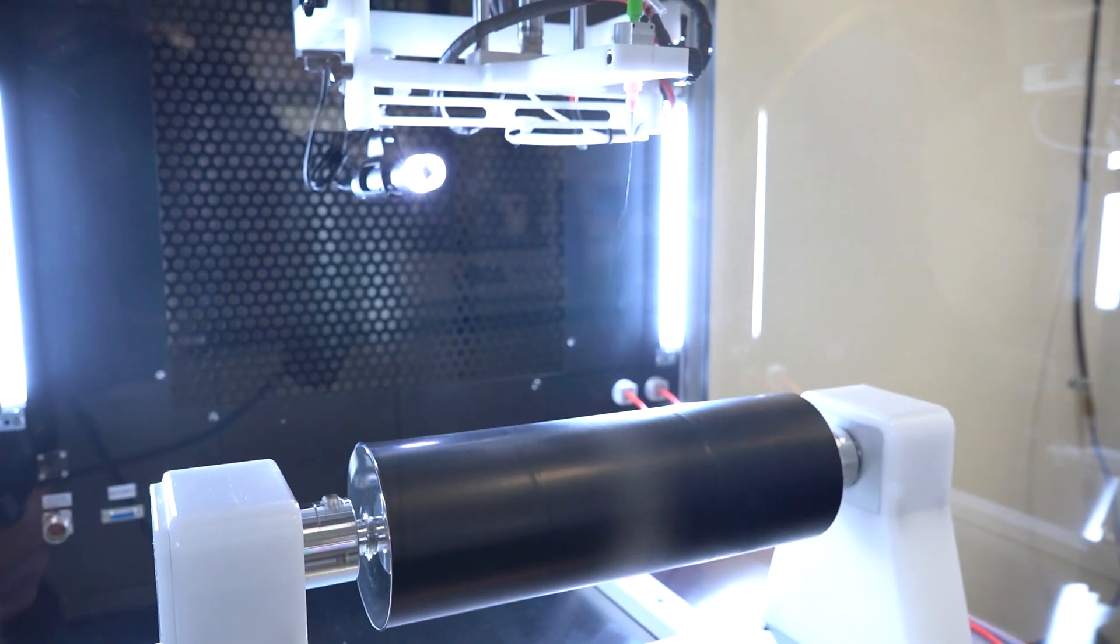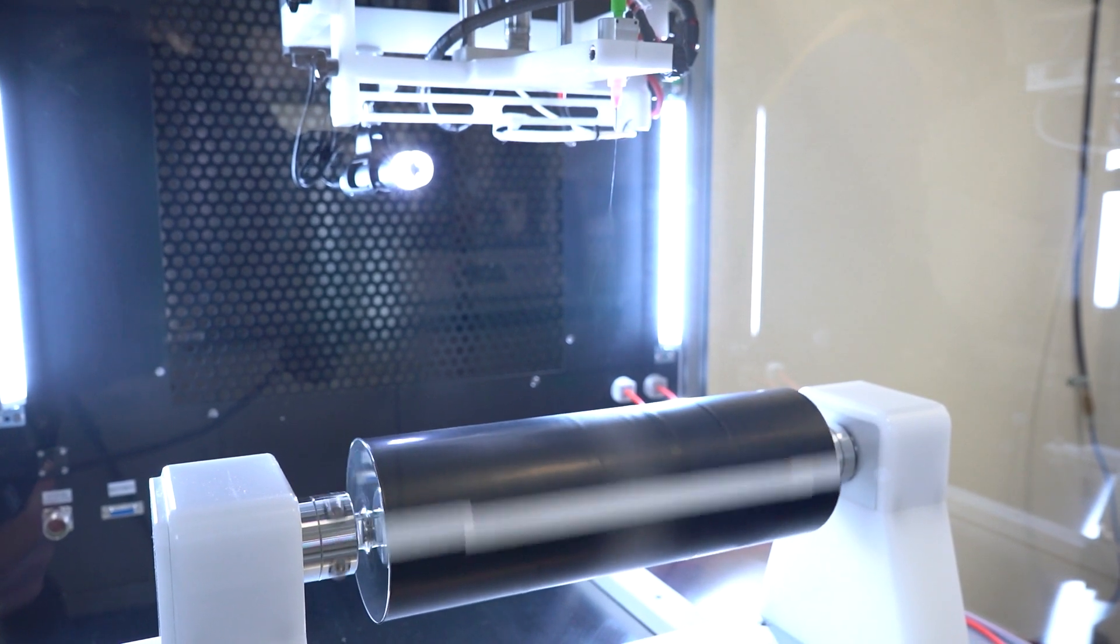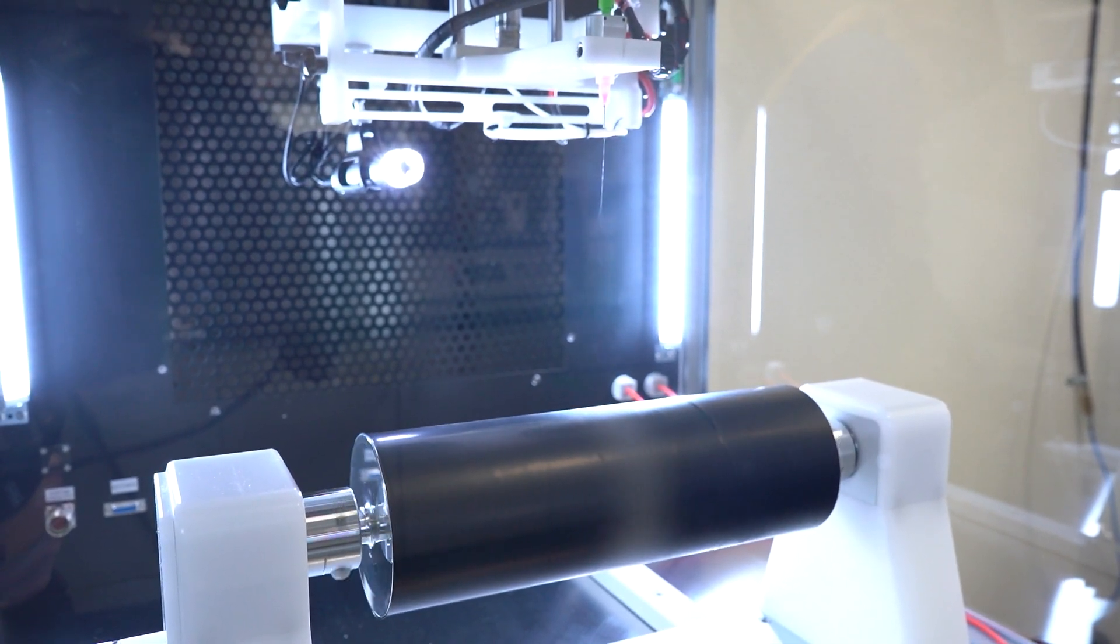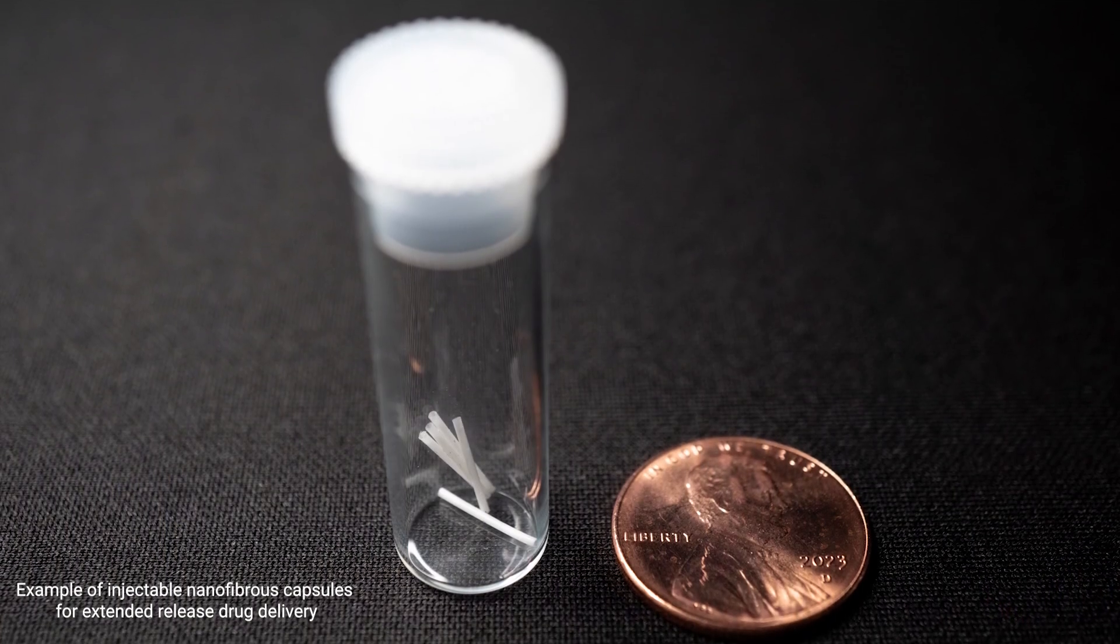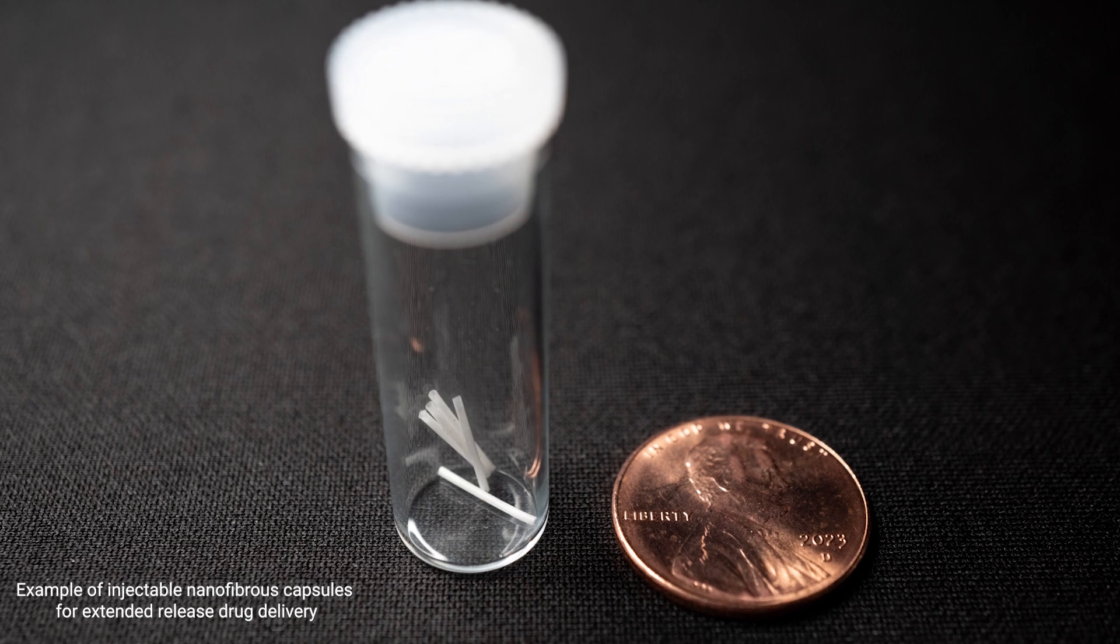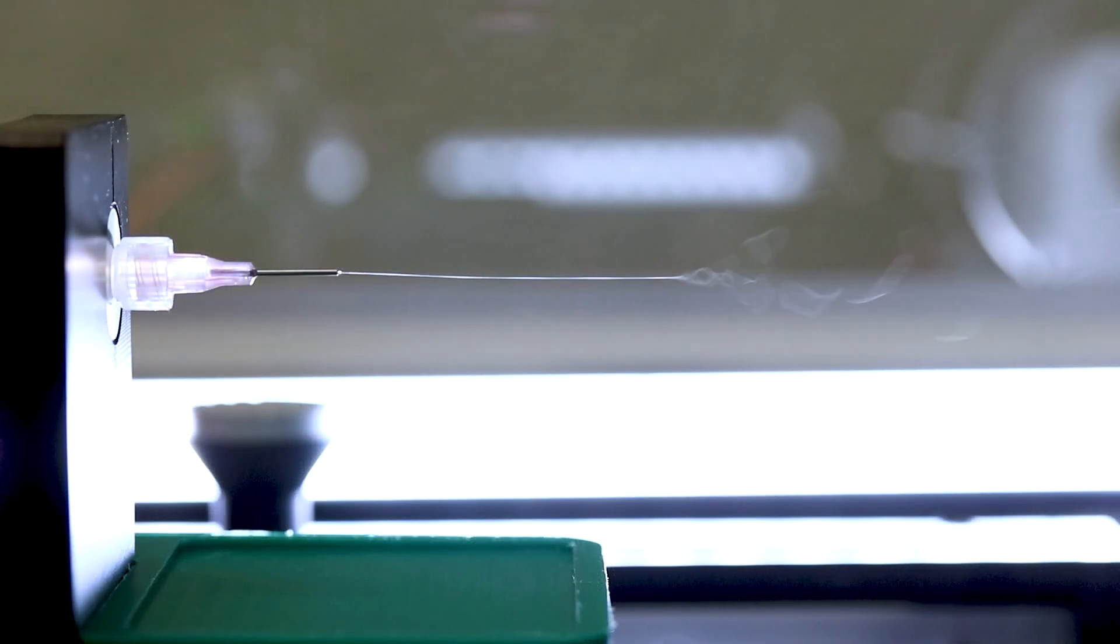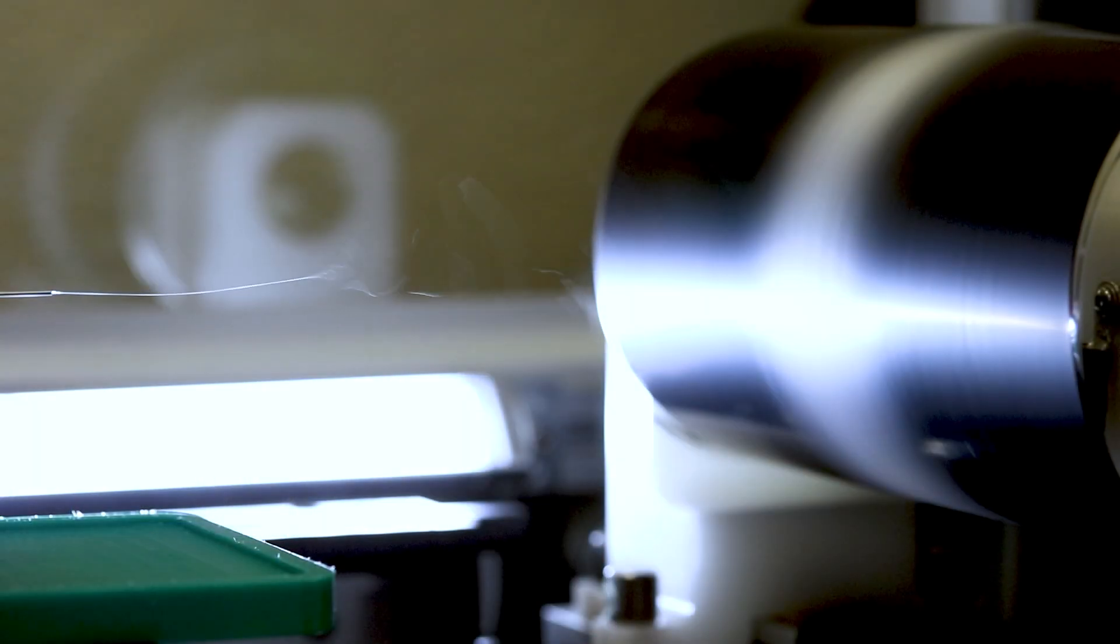As you may have seen from our previous videos, electrospinning is a unique and incredibly versatile technique used in a wide range of applications, from producing nanofibers for textiles to creating drug delivery systems. At its core, it's a process where a high voltage is applied to a solution, typically a dissolved polymer, causing it to eject a fine jet of solution. As the solution stream elongates and whips around, the solvent evaporates and we're left with solidified, ultra-fine fibers.